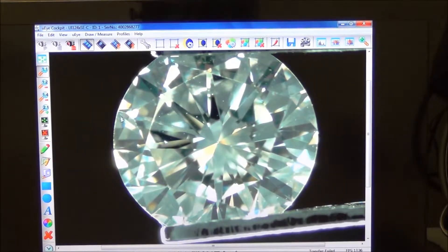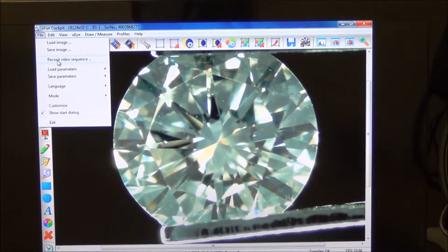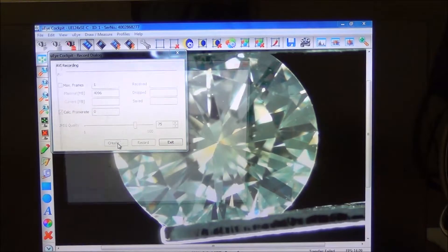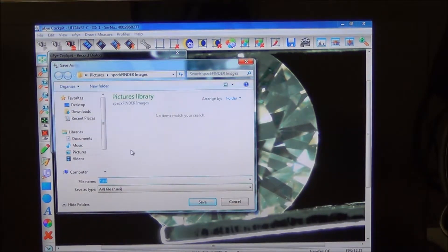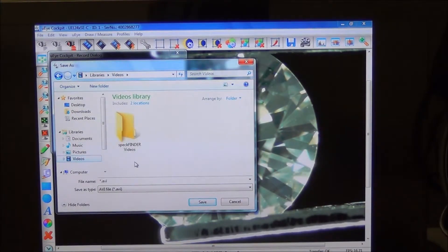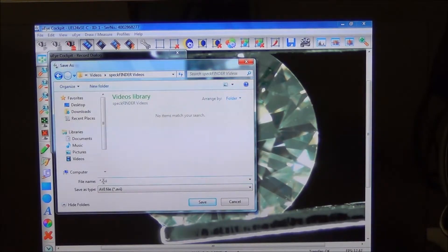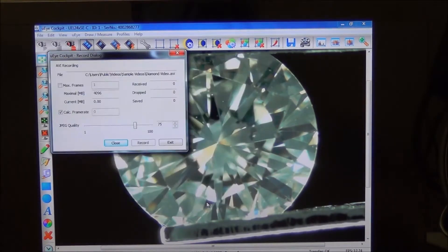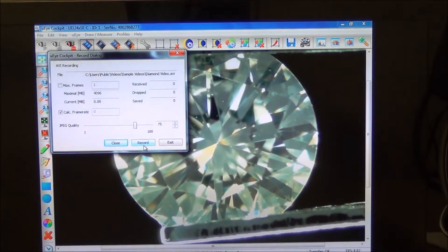In addition to still images, you can also shoot video with the SpecFinder system. Go under the file menu and select 'record video sequence.' It will ask you to create a file — I'll store it under the libraries directory, in a folder called 'SpecFinder Videos.' Name the file — I'll call it 'Diamond Video' — and the default video file format is AVI.